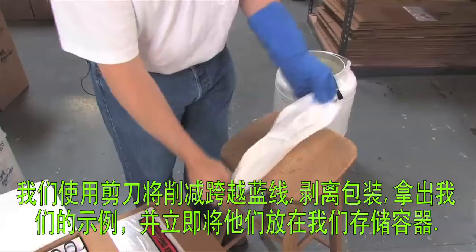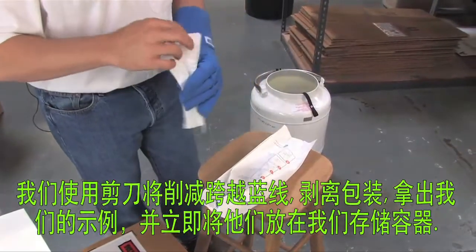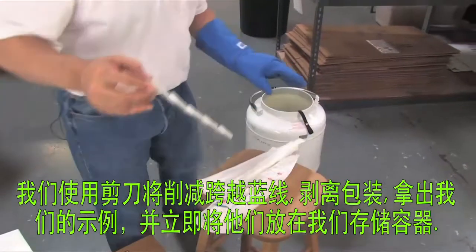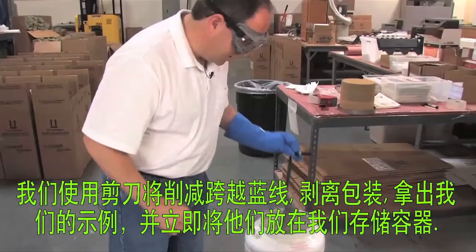Peel back the packaging, remove our samples, and immediately place them in our storage container.